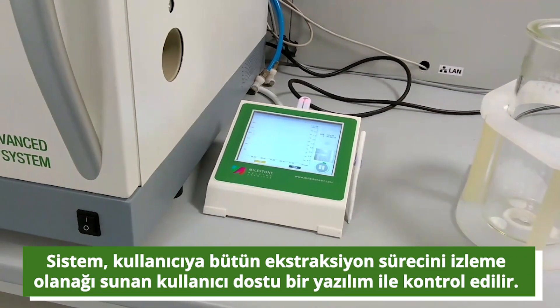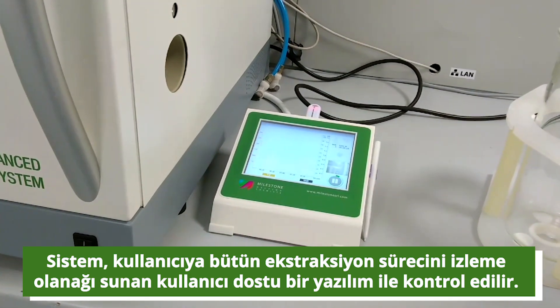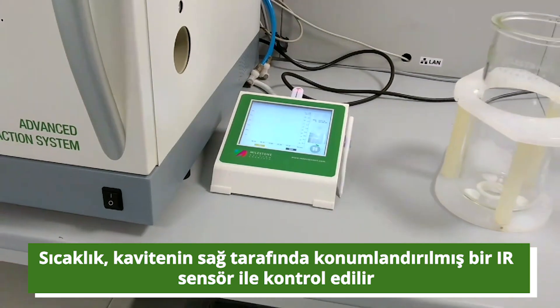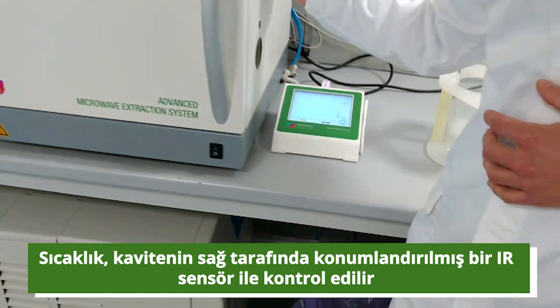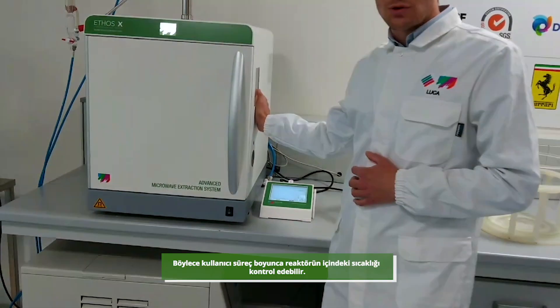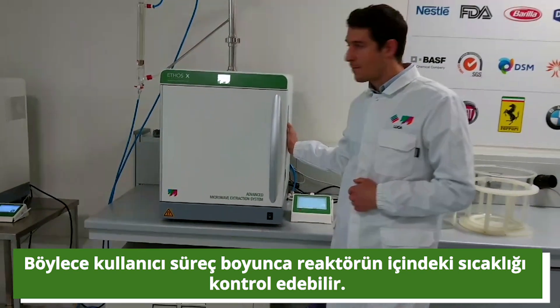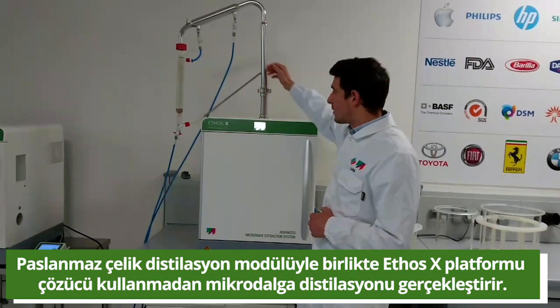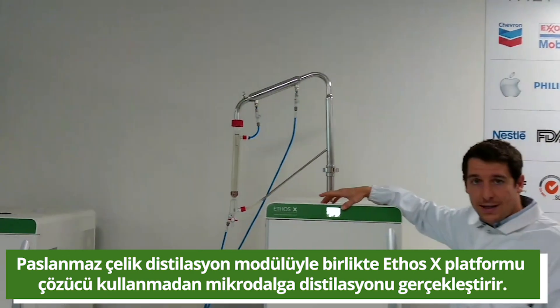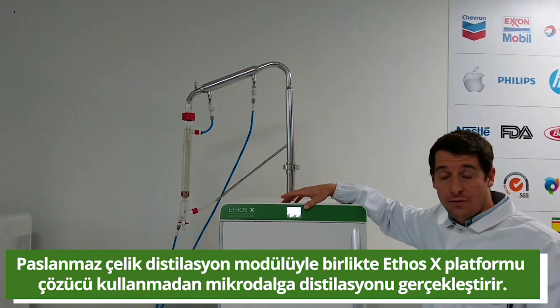The system is controlled by an easy-to-use software which allows the user to monitor the overall extraction process. The temperature is controlled by an IR sensor placed on the right side of the cavity, which allows the user to monitor the overall temperature inside the reactor. Supplemented with stainless steel cabinets and a stainless steel distillation module, the Ethos X platform is able to perform solvent-free microwave distillation.